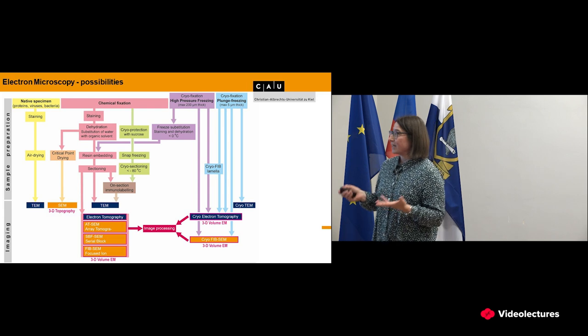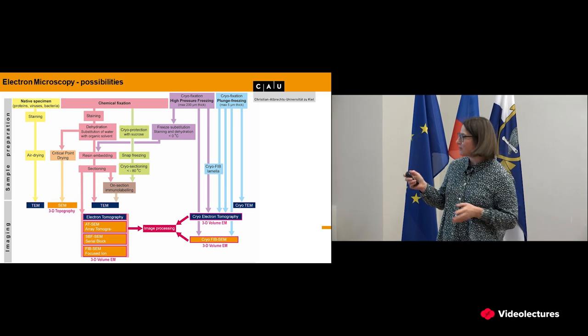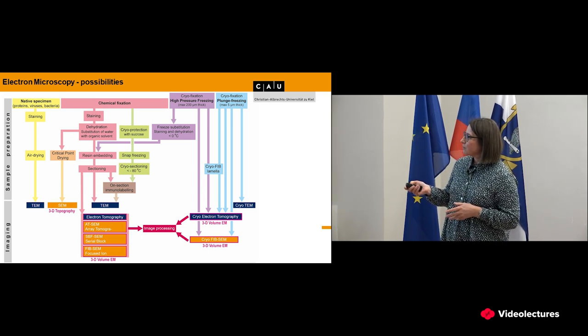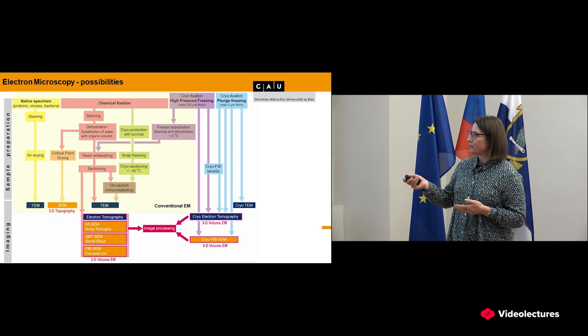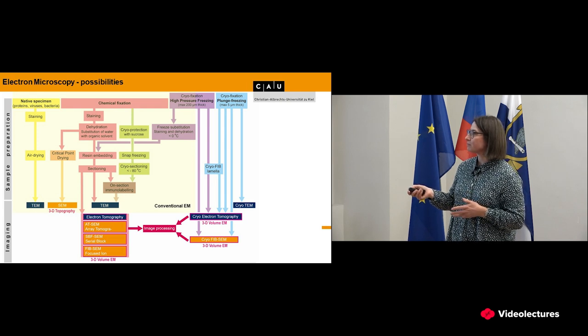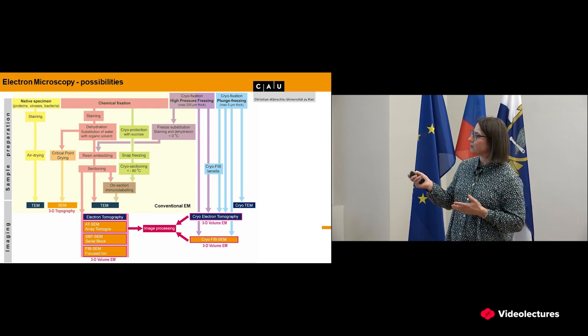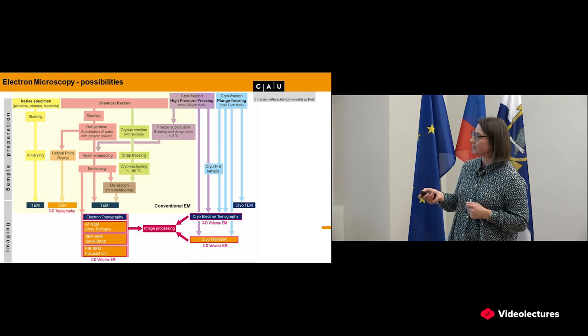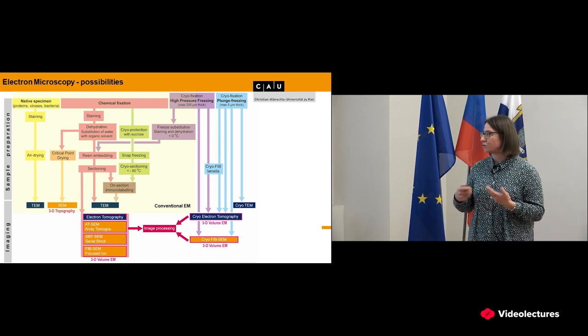So now electron microscopy is extremely complex. I tried to make an organogram. It's difficult to read from the last row, I know. But I'm going to talk mostly about this yellow field, which is what I would call conventional electron microscopy. You can see the sample preparation is very intensive. There are a lot of protocols, a lot of steps. But this is what was already started in the 60s. We just brought it over. Now we have nicer instruments. Here we see the 3D volume EM, and importantly, the sample preparation is more or less the same. Just the microscopes were elaborated to do automated serial sectioning or imaging.